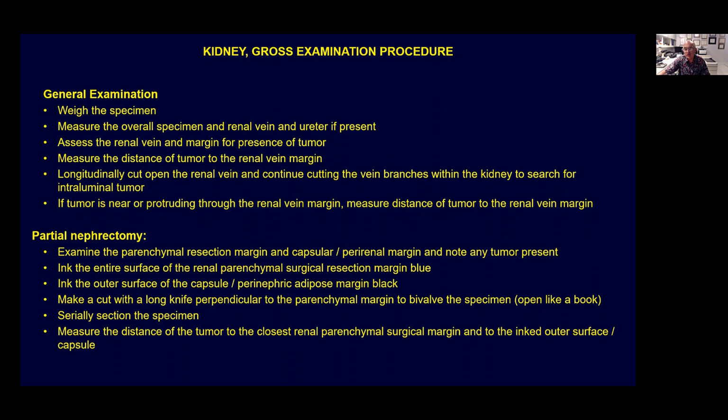Sometimes the surgeons are going to submit margins in separate containers, parenchymal margin or even superficial or capsular margins, when they want to be sure that there is no tumor left over in those areas. However, the main specimen may present positive margins. So when we make the correlation at the end, remember that the final margins are most likely going to be represented by those additional specimens that are submitted and not necessarily by the first specimen.